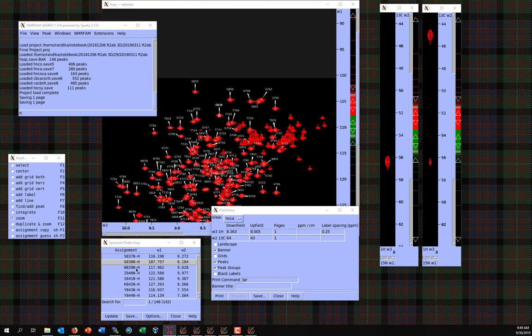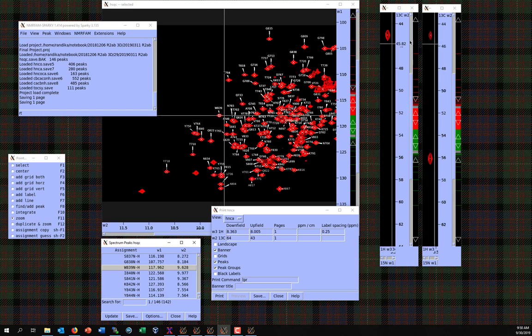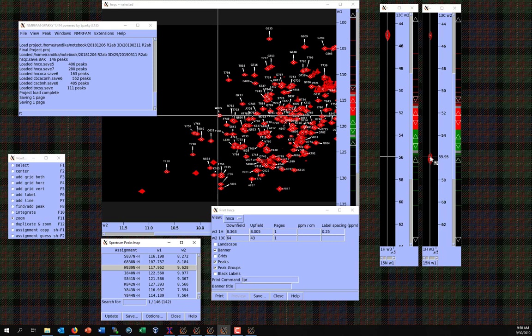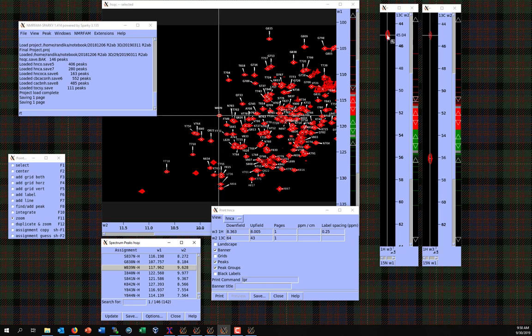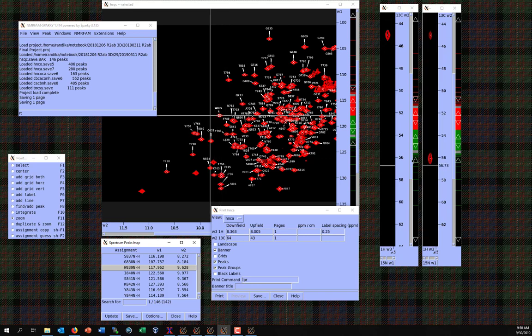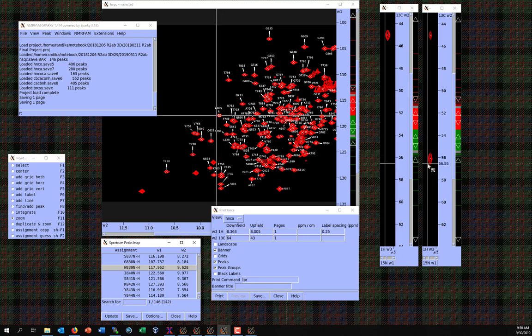And so we were at 838. We're going to go here to 839. And what we should hopefully see is, yep, again, those strips should come through. Randy has done this so that you can see that the peaks have been picked in the HNCA and the HNCOCA. You may want to turn those off with, I think it's L capital B, or maybe it's OS for ornament show. I can't remember. But since they're just the peaks, it's fine, I think, to leave them in here. They're not very big. They're not obtrusive. They're not going to mess up our strip plot.